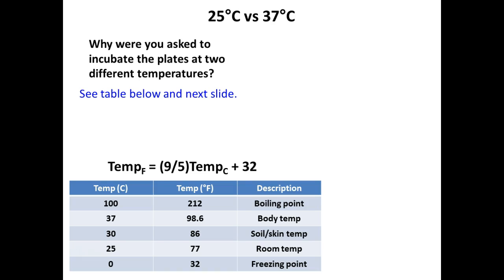Room temperature, which I'm happy to say is staying around 77. There are times this room used to peak around 80, and that incubator's heating element usually never turns on. But we don't have refrigeration with the incubators, right? So it was never cooling it back down. So even though we had 35 written on there, it never would read on the digital readout. But right now it is.